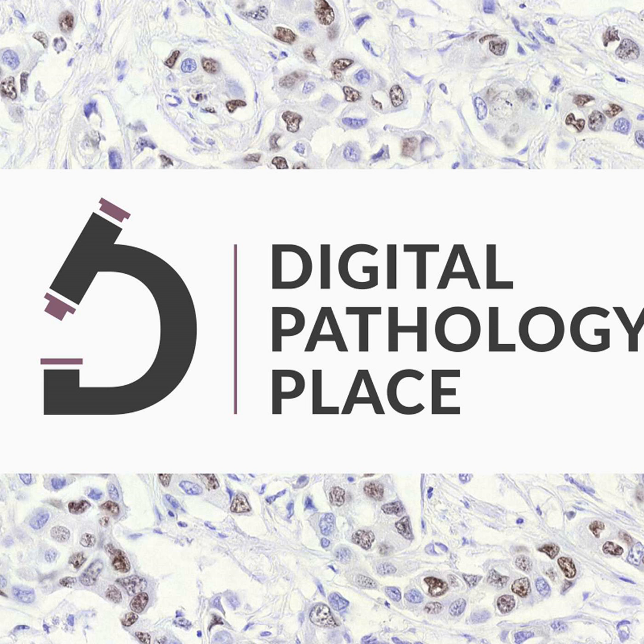We have always really been focused on clinically actionable scenarios. So like if you sign out a pathology report and you want that data to immediately populate a staging form for an oncologist, it needs to be 100% ready to go at that moment, and not really go through a process like a retrospective curation and sign-off process on the data quality, right? So if you need the data to be ready to go like immediately without any sort of quality checks beyond the pathologist or whichever doctor signed this case out, essentially generated and curated their own data in real time, signed it out, and it can be used right away. It's considered high quality and like what we call clinically actionable data.